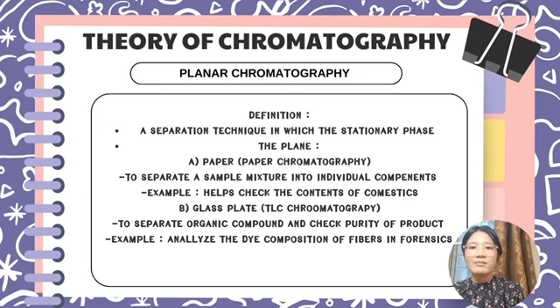The definition of planar chromatography is a separation technique in which the stationary phase. The use of paper chromatography is to separate a mixture into individual components. Next, TLC chromatography is to separate organic compounds and check the purity of a product.